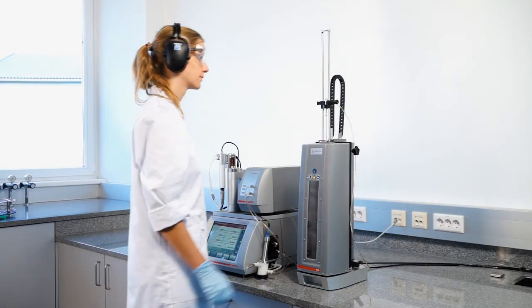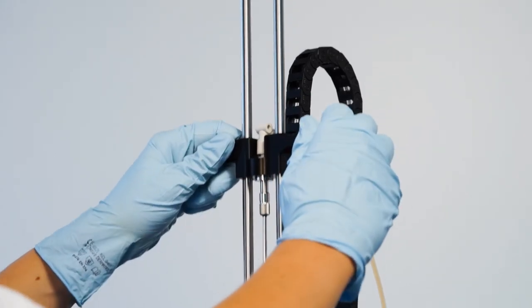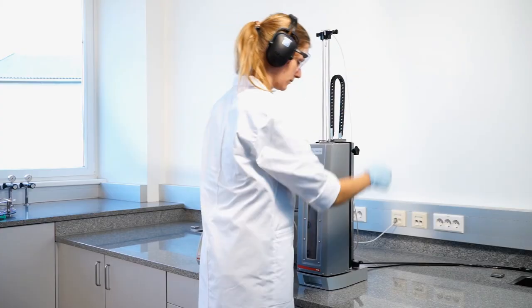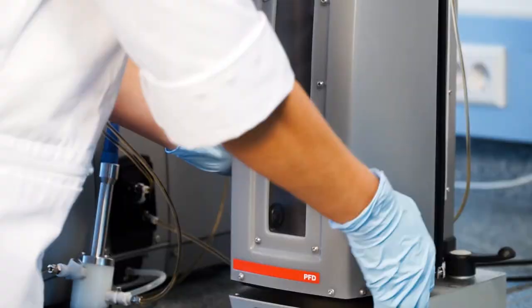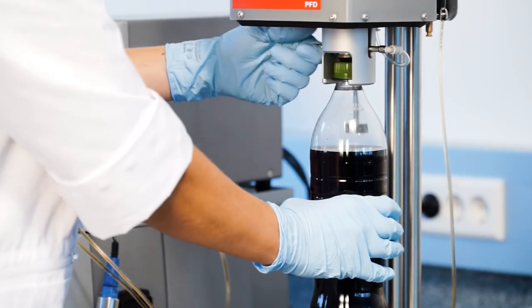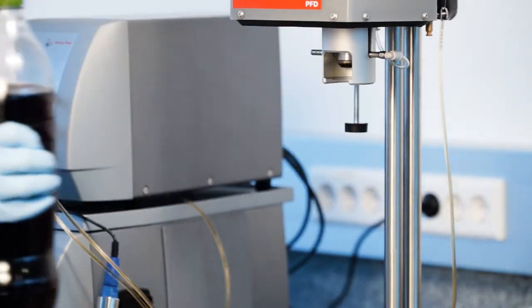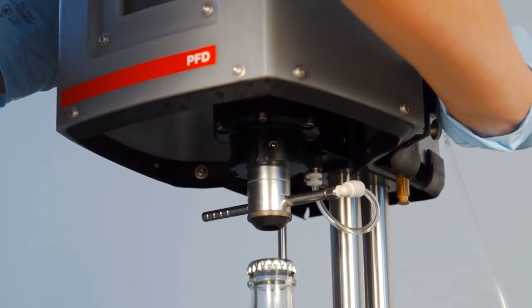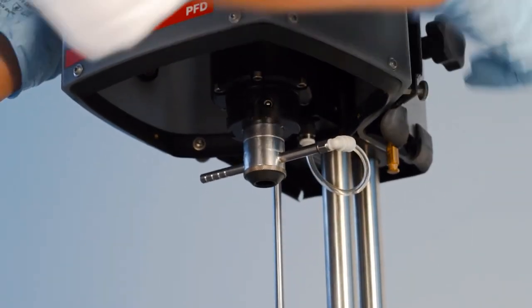To remove the container after your measurement is done, raise the filling tube, release the pressure, and open the safety shield. Lift the handle to easily remove the container. In case you are going to change the package type for the next measurement cycle, you might need to change the height as well.